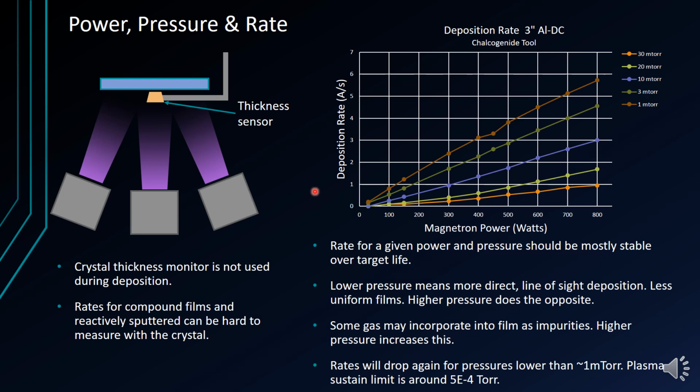Sputtering processes are controlled by the gases present, their flow ratios, the total pressure, and the power supplied to the guns. Therefore, it is important to understand a basic relationship between these parameters. Our systems are configured so that a crystal rate monitor can be placed very close to the center, where the wafer would actually sit during process. To that effect, we cannot use the crystal to collect a rate and coat our substrate uniformly at the same time. Using the crystal monitor, we can collect data about deposition rates for various power and pressure combinations, and then use that data to plan our process times.